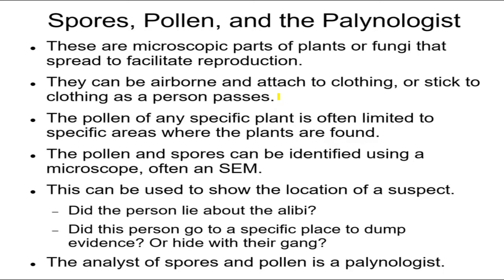You need a microscope to catch this. This stuff is generally not easily visible by the eye, and you need a microscope to examine it. Sometimes you even need a scanning electron microscope with the electrons. You need to magnify it 100,000 times in order to be sure about the pollen that you found on his clothing. It's true also for spores.